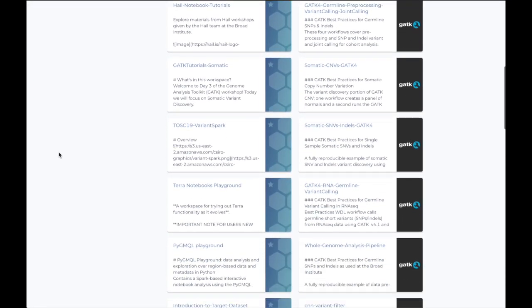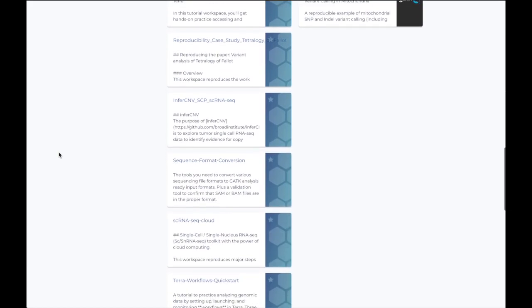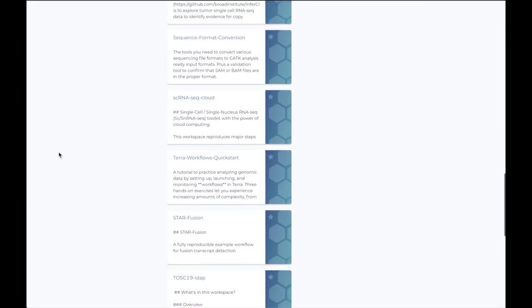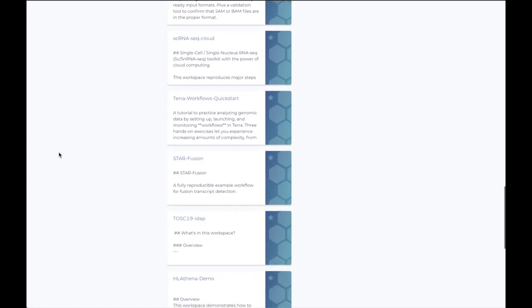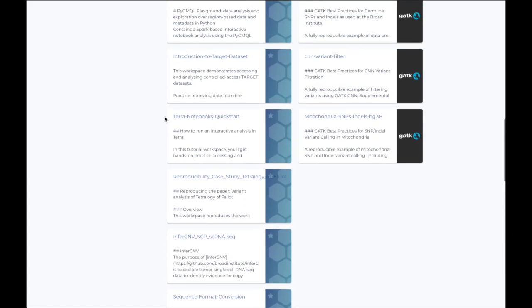For first-time users, we recommend getting hands-on with our Workflows Quickstart tutorial, or try your hand at Interactive Analysis using our Notebooks Quickstart.